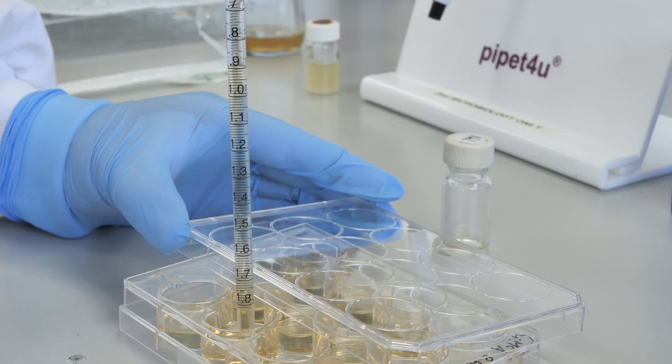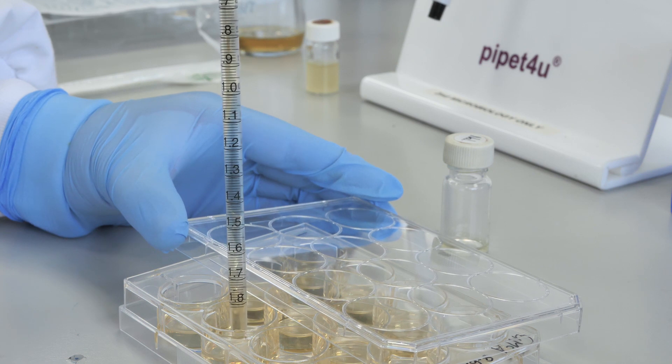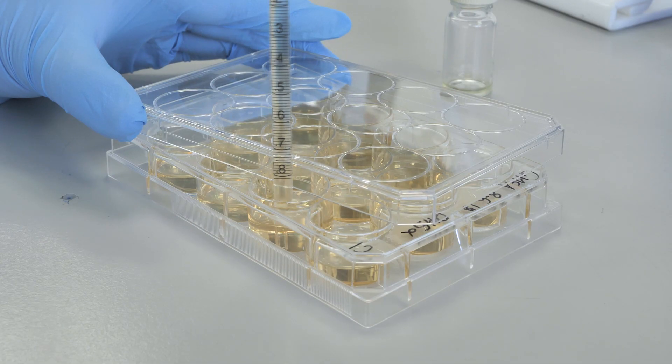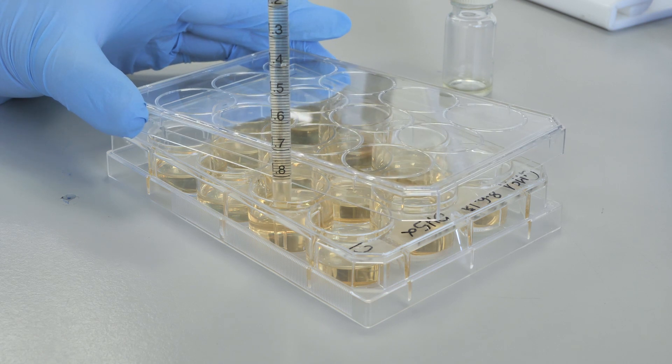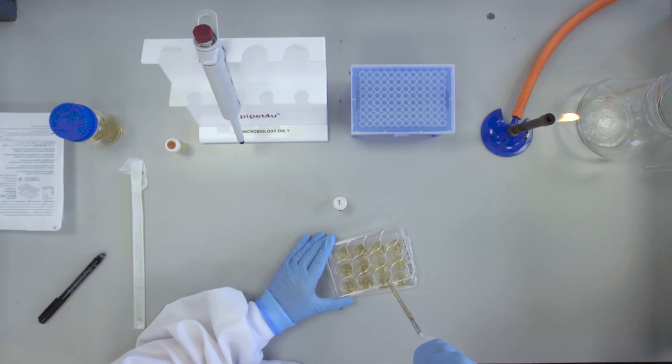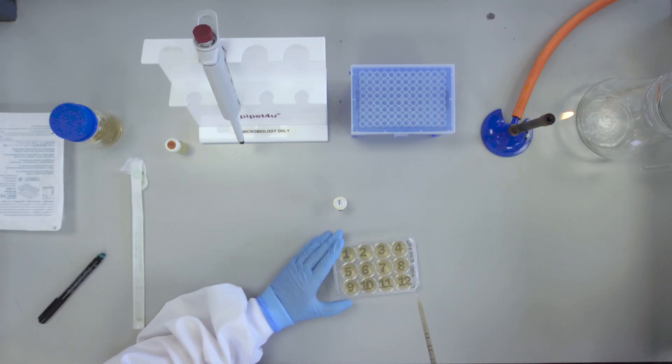This corresponds to a concentration of 1 microgram per ml nalidixic acid. Instead of transferring into well number 12, discard the 2ml remaining in the pipette. Well number 12 will act as a control.